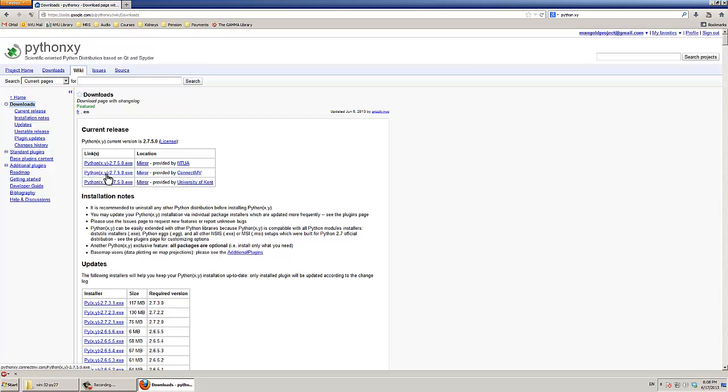You basically download it, you click on the exe file, you click next, next, next. There's a typical installation, you go through with it. It's a fairly large installation, I think maybe half a gig. So just make sure you have enough space before starting. I'm not going to actually go through the PythonXY installation because I already have it installed on my computer. But this is really, really straightforward. So just download one file, click on it, and follow the instructions, which are almost fail-safe.